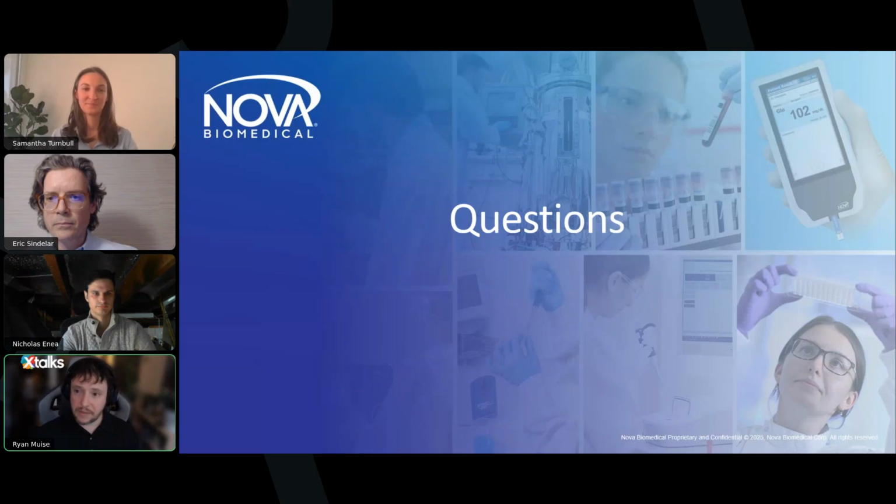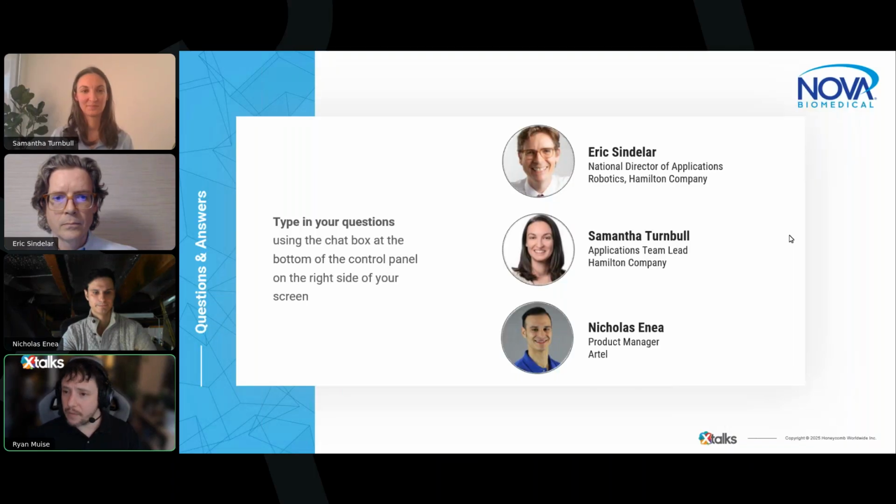Now, I've already received some questions from the audience, so we'll get ourselves started with those. The very first question I have here, it just wants to know, what are the most impactful liquid class parameters that one should consider?